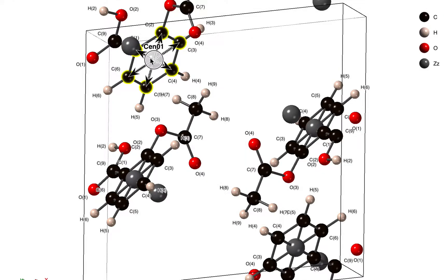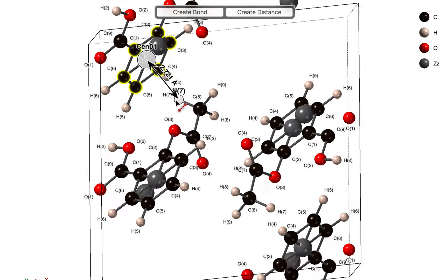We have a dummy atom, a grey atom here in the center of this ring, and we can use that to give us a distance from the center of the ring to the next molecule.